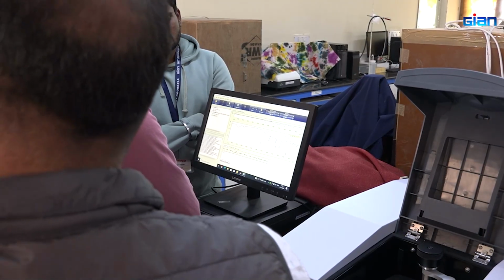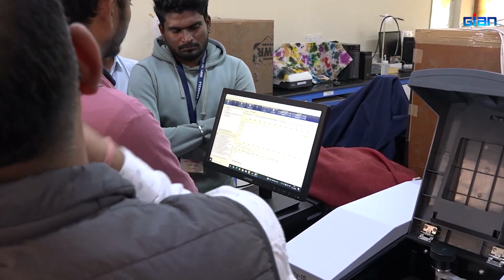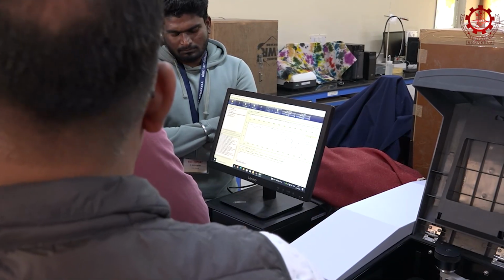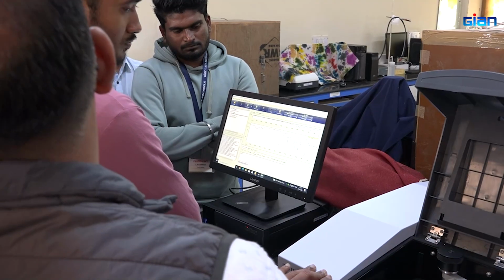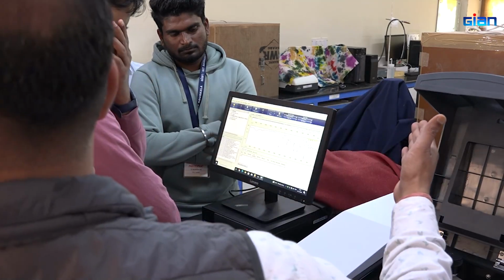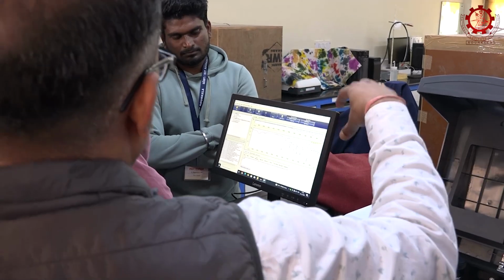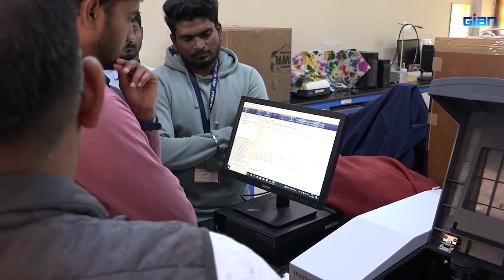In this interaction, the molecule will absorb some amount of the radiation you are giving. So this is the principle of spectroscopic methods. Once the molecule absorbs, the rest, which is not absorbed, will pass, and that energy will be detected by another piece of equipment, that is called the detector.